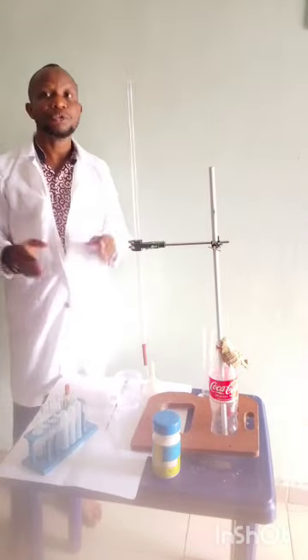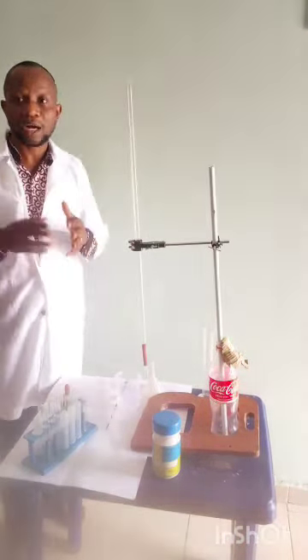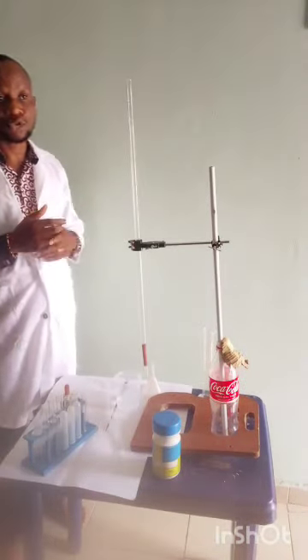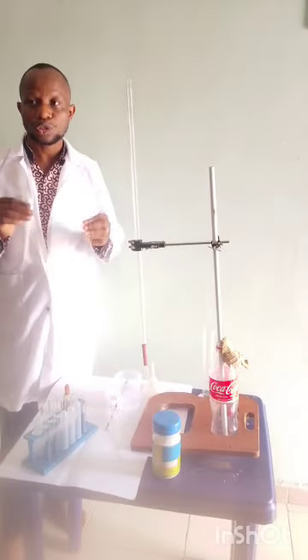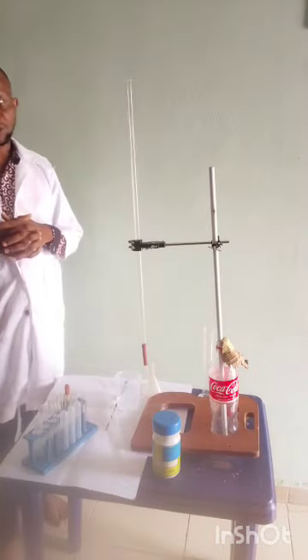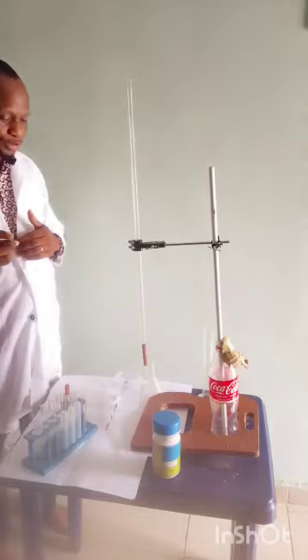But if it is a redox titration between probably KMnO4 and iron sulfate, or iodine solution and a reducing agent, we use starch solution as the indicator. That is the blue-black reaction.